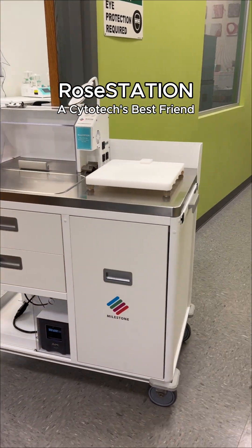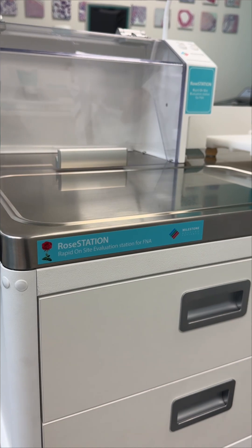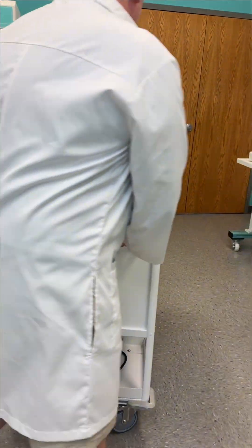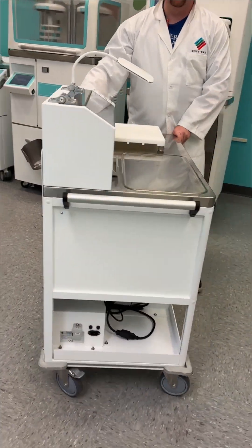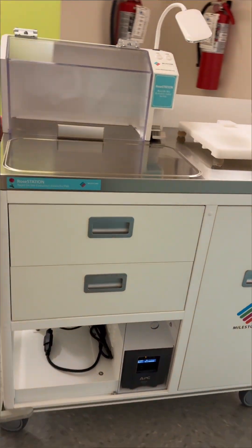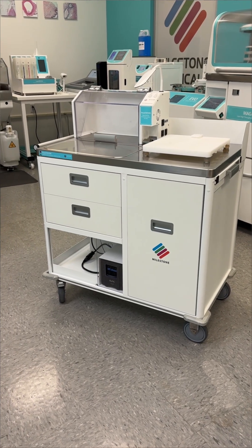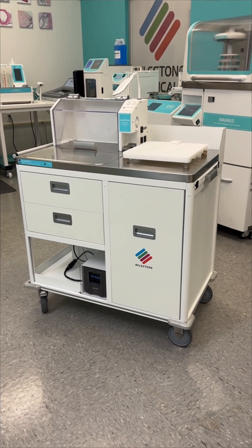If you're a cytotech, you know how important it is to have everything you need at your fingertips during FNA procedures. The Rose Station was designed with you in mind, giving you a versatile, reliable, and mobile workstation that makes your workflow smoother. With our Rose Station, you have a versatile and very handy unit for cytology and cytotechnologists, especially during FNA procedures.